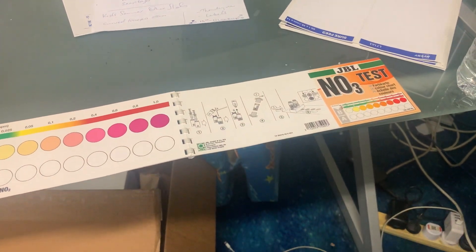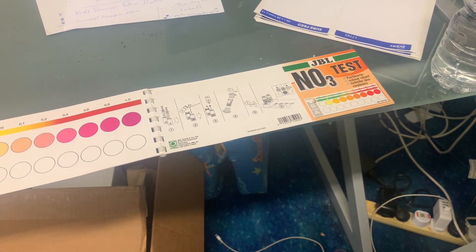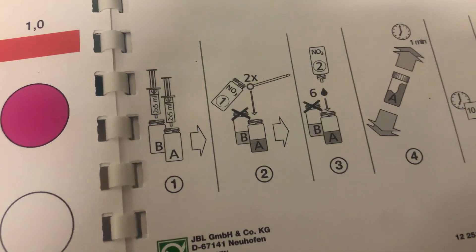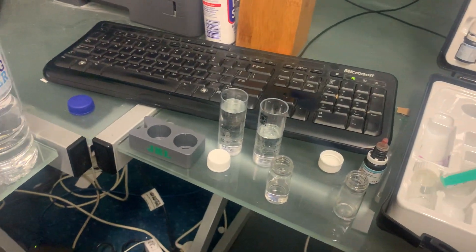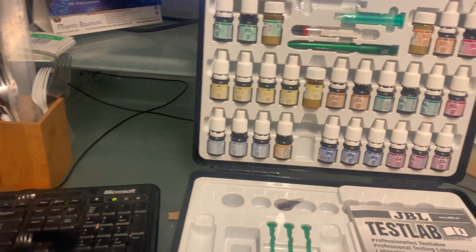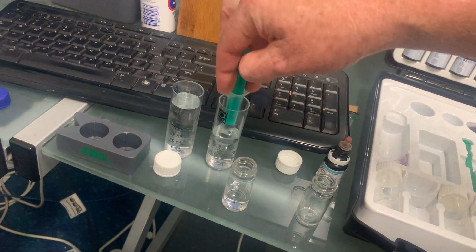I'm going to show you how to do a JBL nitrate test. These are very effective and very easy to use tests which I recommend highly. You can get these tests individually or as part of a multi-pack like this.